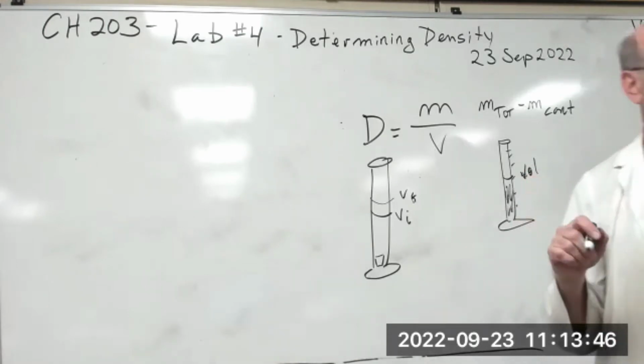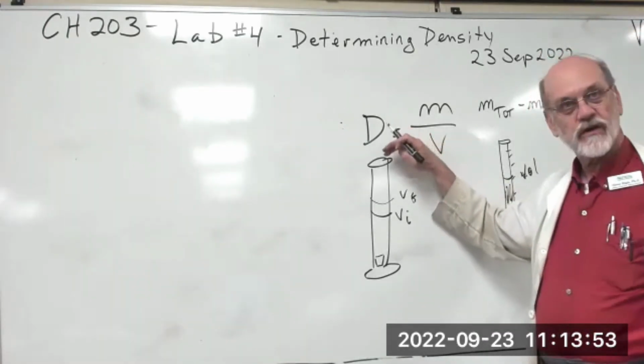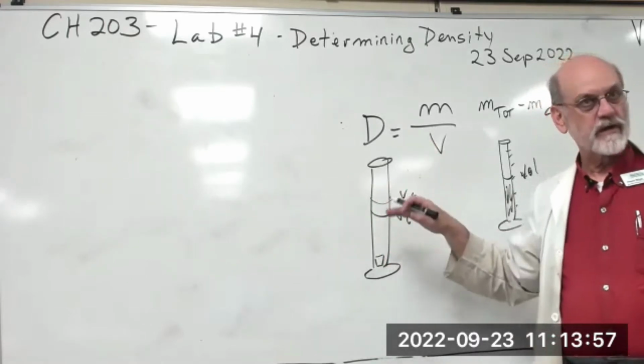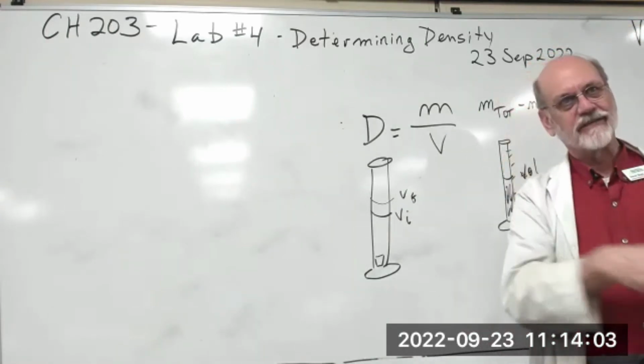The zinc's pretty heavy, right? It's going to go to the bottom fast. So if you drop it from a height, the water's not going to slow it down enough. It might hit the bottom and crack your cylinder. So unless you have a plastic cylinder. If your cylinder's glass, then just tilt it on the side and let it slide down.